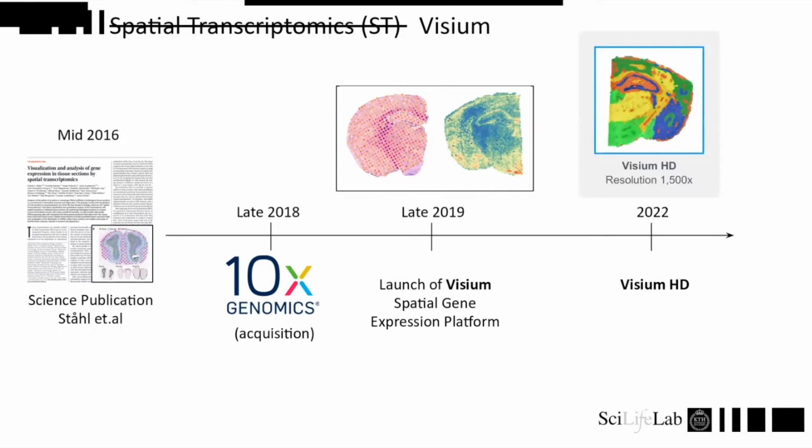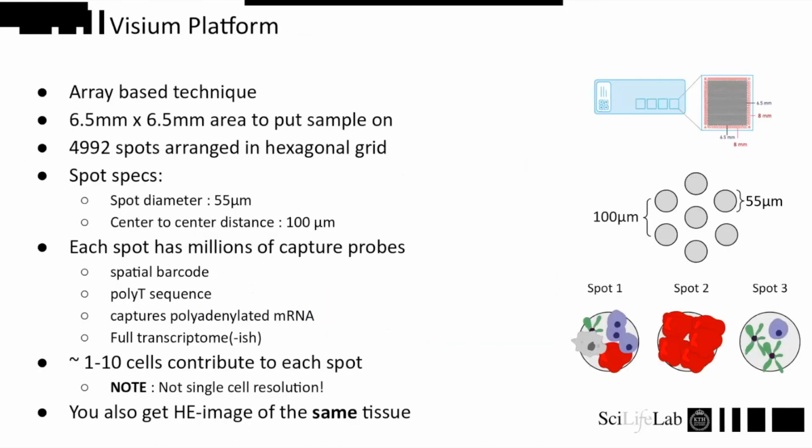We also have some prospects of what's going to happen here with the Visium HD platform being launched in late 2022, at least according to the JP Morgan presentation that 10x had a week ago. I think it's mostly relevant for us to speak about the Visium platform. That's the type of data that you will be looking at. So I wanted to give you some specs just so you know what you are actually working with.